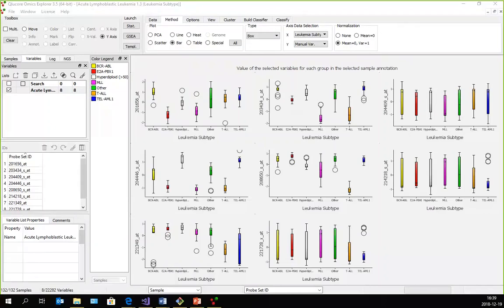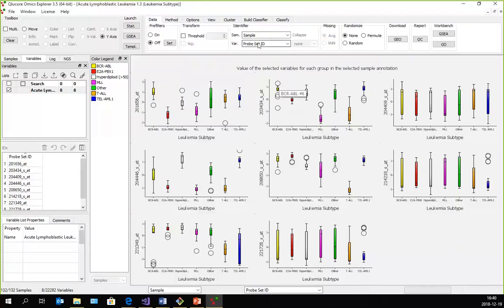Let me see here. How can we average the variables? There are ways of averaging variables available. However, if I understand your question correctly, how can we average the variables? Well, if you want to average your variables, you must ask yourself, what are you averaging on? There is one way of averaging variables available.